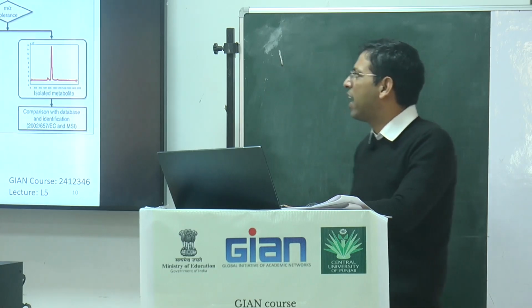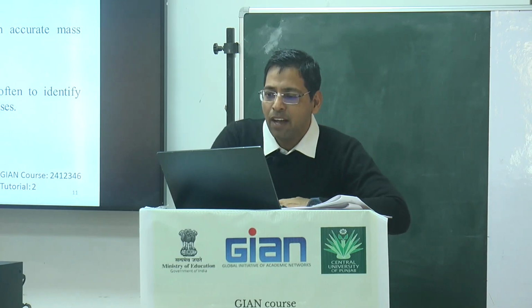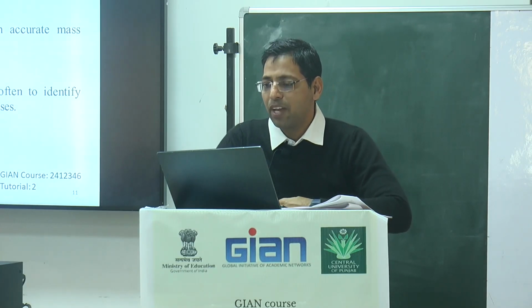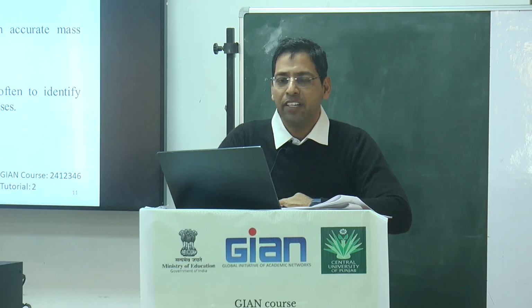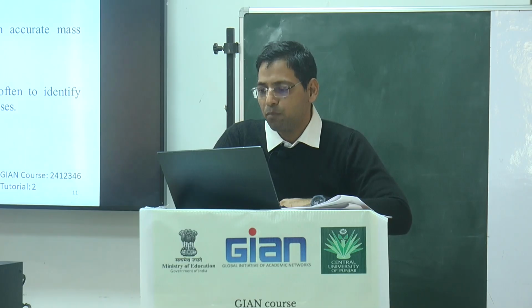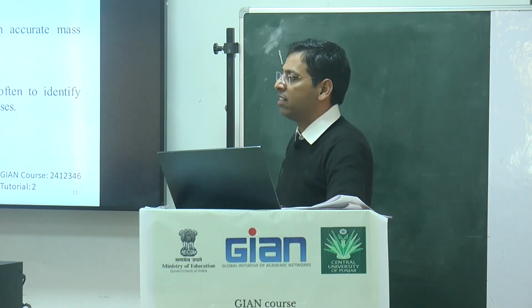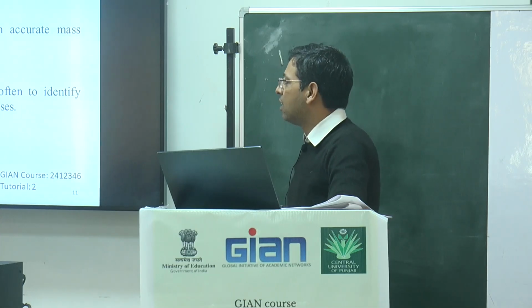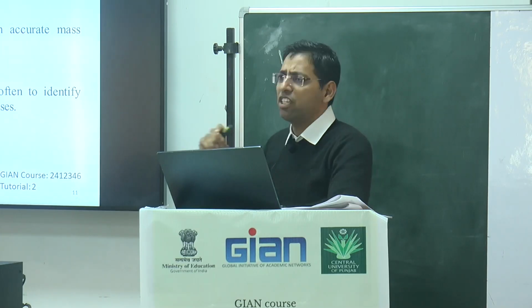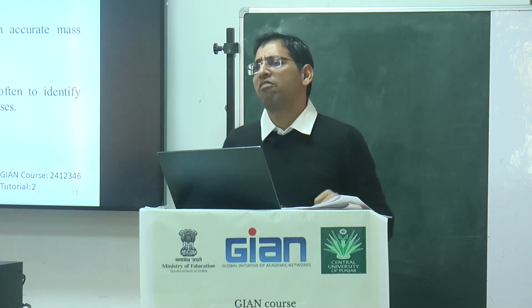So the platform for the identification is another step. For LRMS, we are using the SIM and SRM for high sensitivity and broad dynamic range, suitable for large scale metabolic profiling. For HRMS, we are going with the full scan mode, and accurate mass deviation is necessary for the identification. The ultimate goal of the targeted metabolites is often to identify the specific metabolites associated with some particular biological variation.